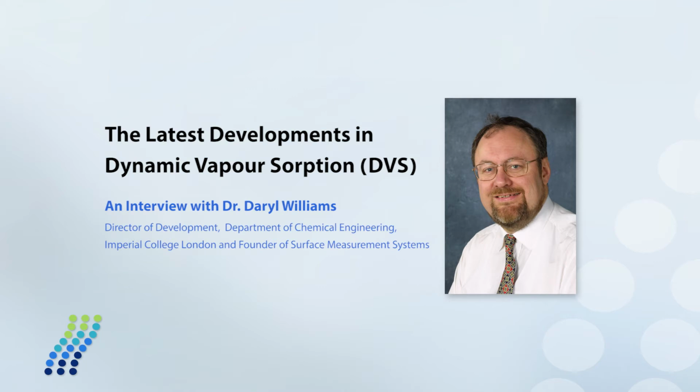When we do a DVS experiment, we will discover that water vapour that we expose a sample to can be adsorbed on the surface, it can be absorbed in the bulk, or it can actually condense in pores in the material. So there are three distinct locations where we might find water molecules in a material after we've done a DVS experiment. Because of those three different environments, we can actually obtain three different types of data.